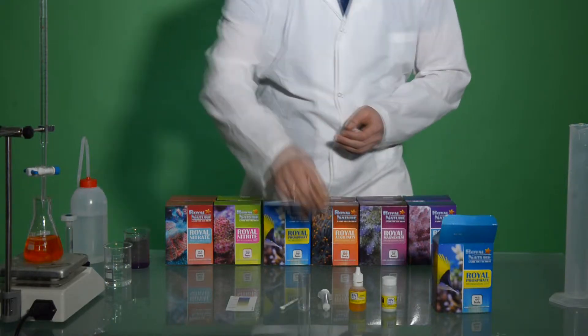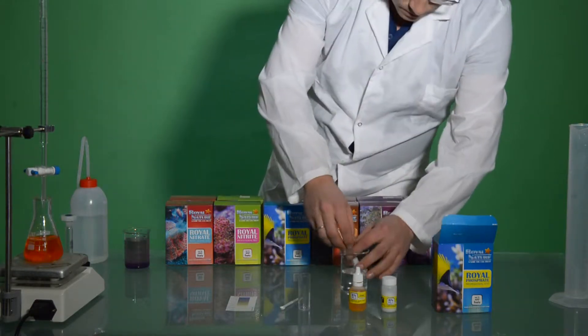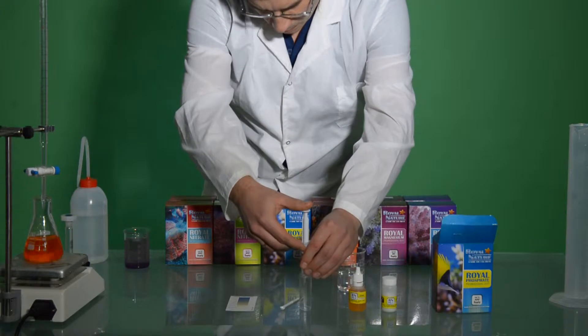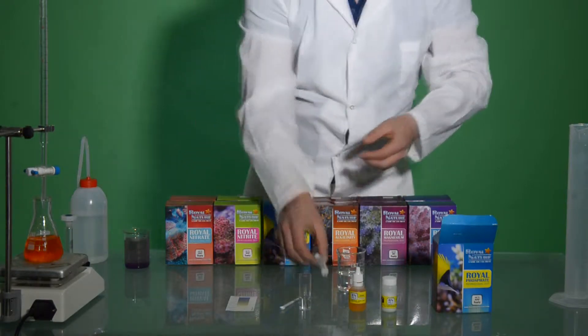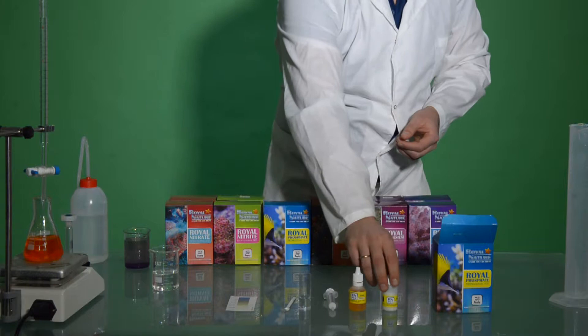using the 5ml syringe, we add 5ml of aquarium water to our Test VL. In this case, we took a fresh mix of Royal Nature Premium salt, in order to show you the levels of phosphate, if at all, inside our Royal Nature Premium salt.